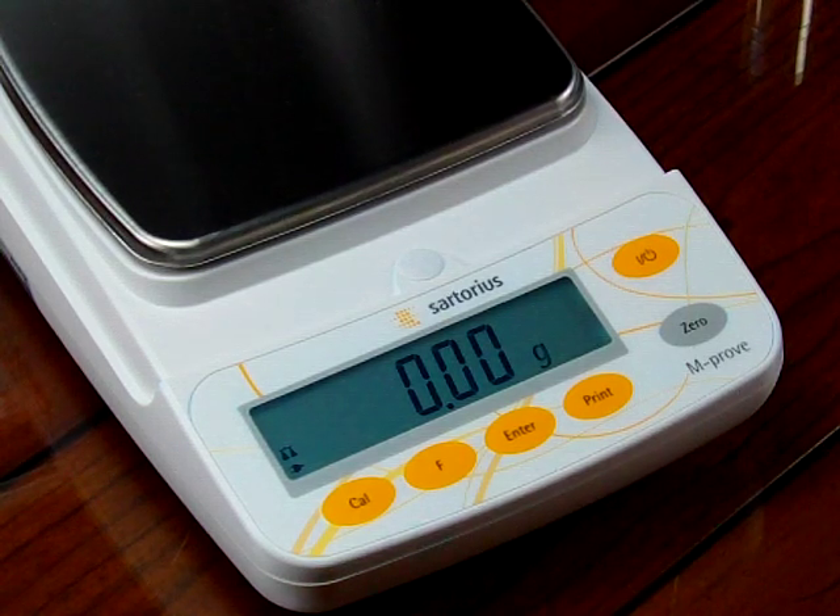In this demonstration, we're going to walk you through how to change the weigh modes for a Sartorius AY series. The balance we'll be using today is an AY412. The balances are delivered such that they weigh in grams only, so there are no other functions enabled.